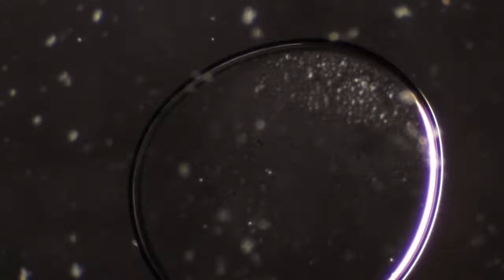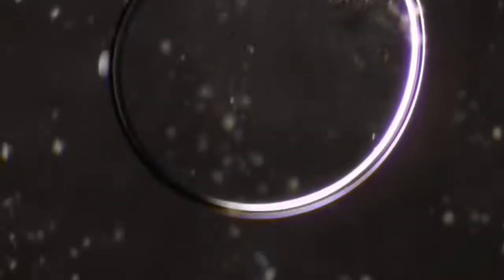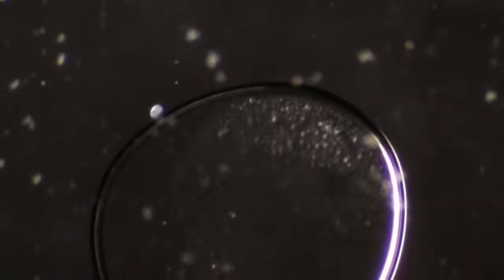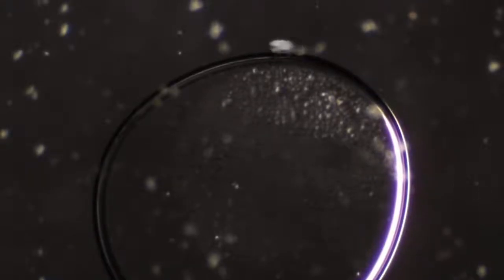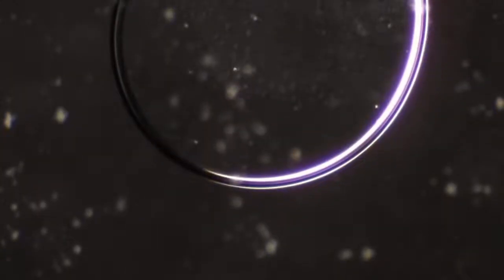Oh, now he's going the opposite way. Look at that. This is a trip. I've never seen this behavior before. Oh, now it's stopped. Somehow it stopped. And it's off again. This is hilarious. I've never seen this. I guess ciliates know how to have fun too.